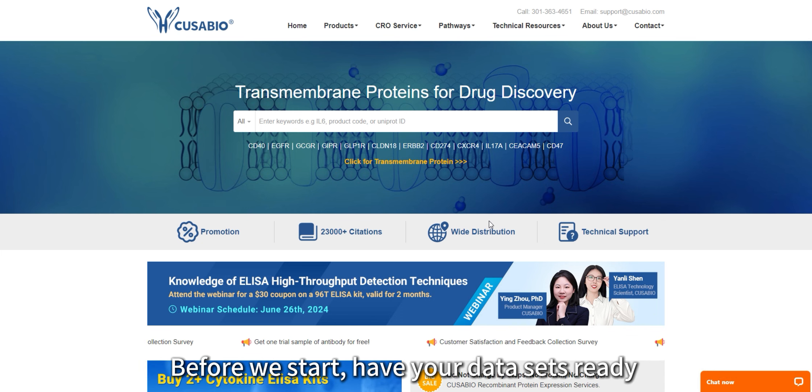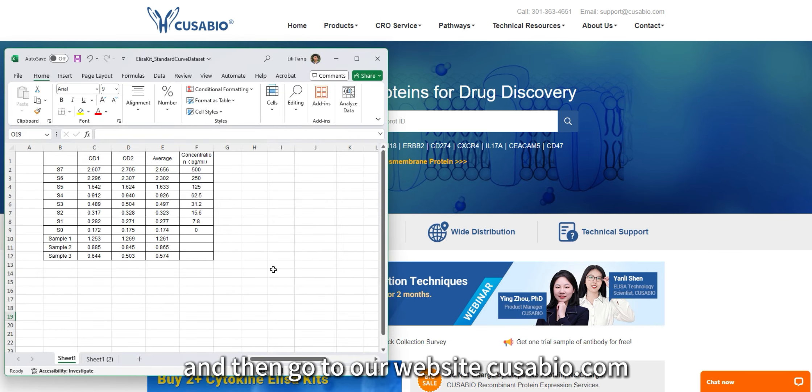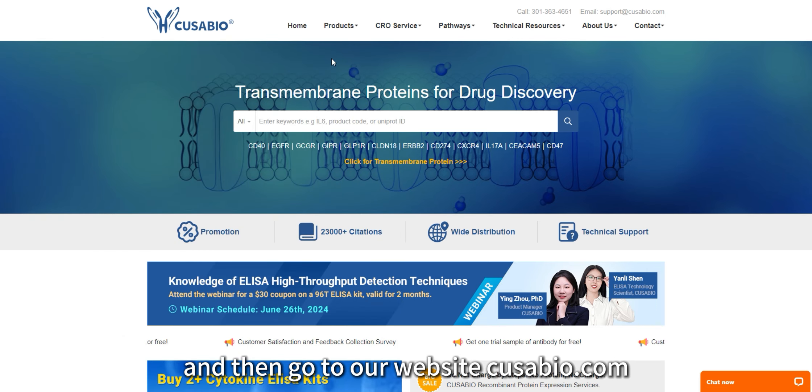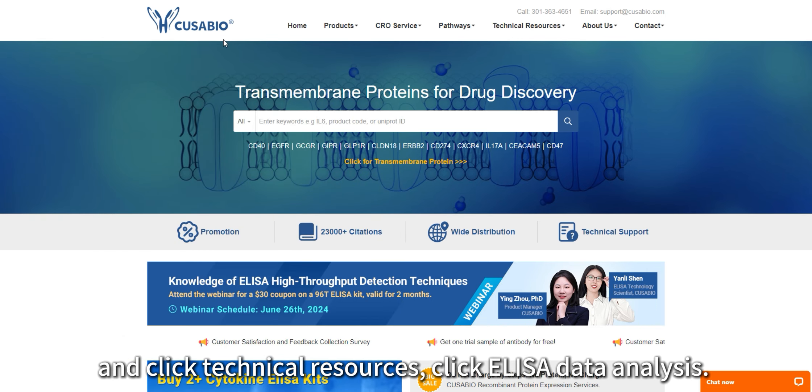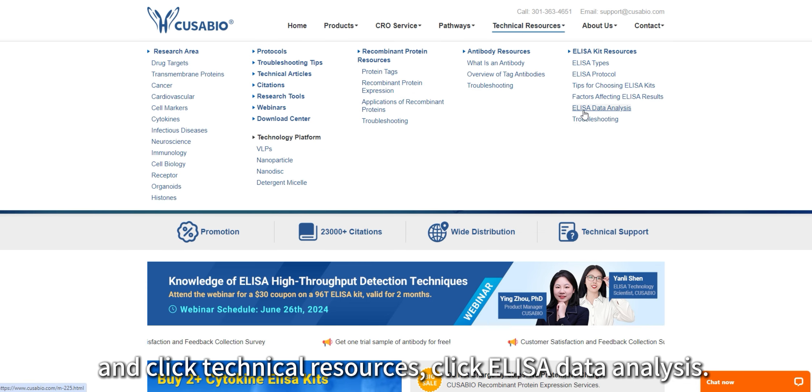Before we start, have your datasets ready. Then go to our website cusabio.com, navigate to Technical Resources, and click ELISA Data Analysis.